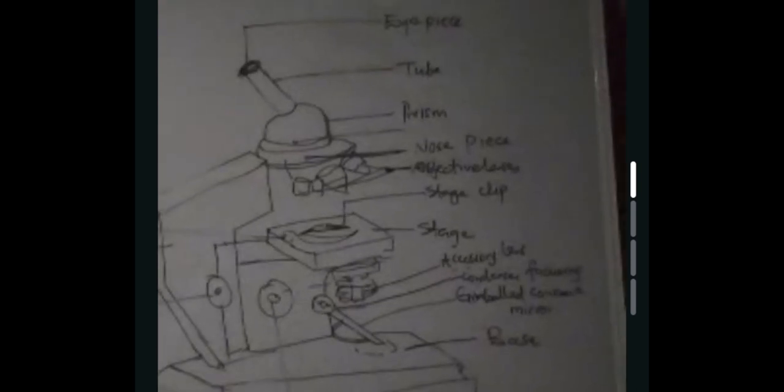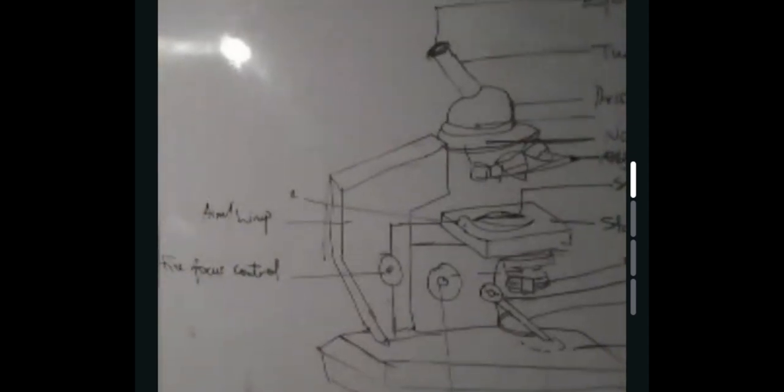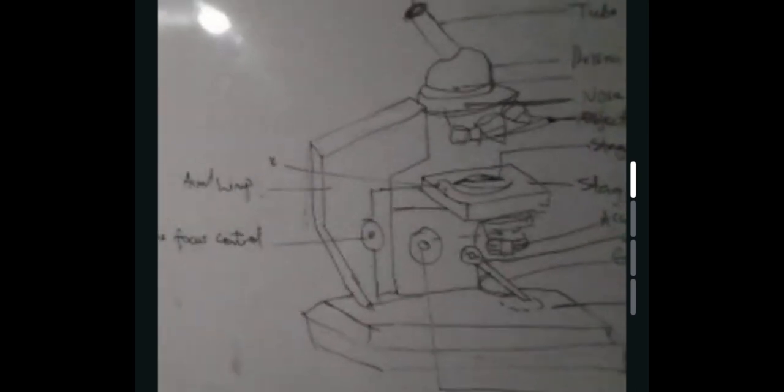These 3 dots here in the stage, they mean something. Is there anyone that will tell us that? Let me label it number 4. Anyone?